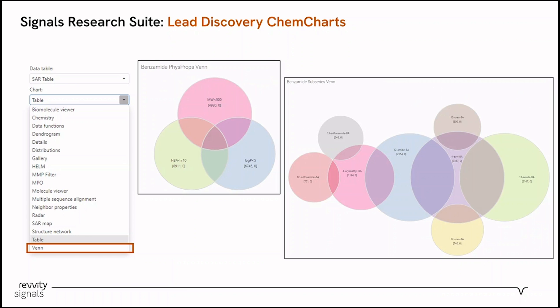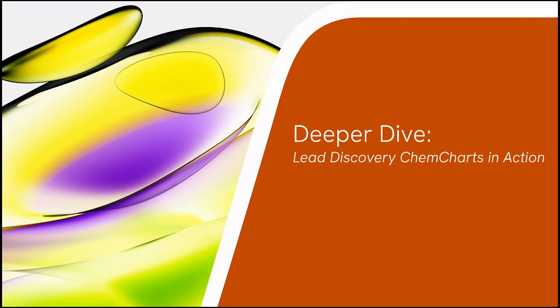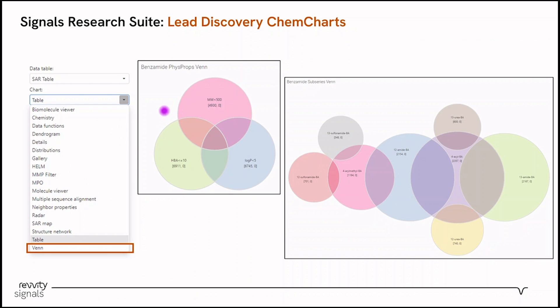The last one that I'm going to highlight for now is a Venn diagram. Just like really any of these chem charts, you can run the gamut from very simple to very complex data visualizations. Something like this diagram here is going to be a Venn diagram where each circle represents basically one of Lipinski's rules — you can see how many compounds lie in each circle and in the intersections. You can also get more creative: here, I've already defined a chemical series and a sub-series, and so each of these circles represents a certain chemotype of substituents at a given position.